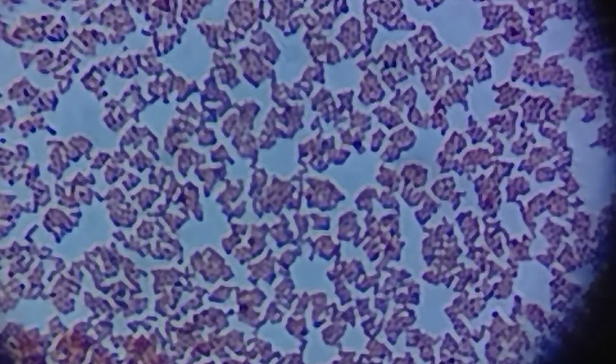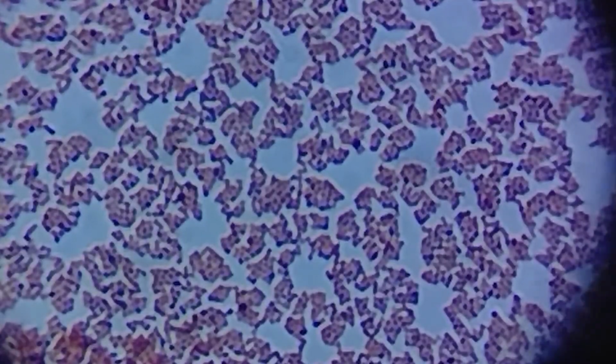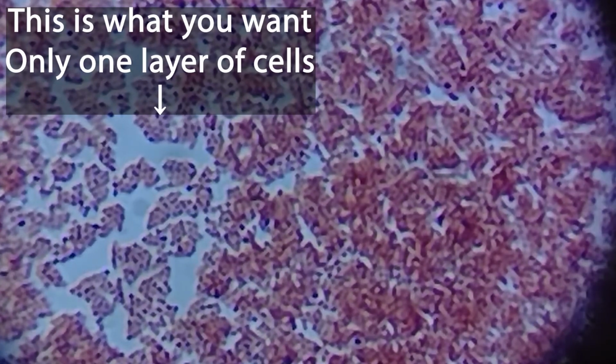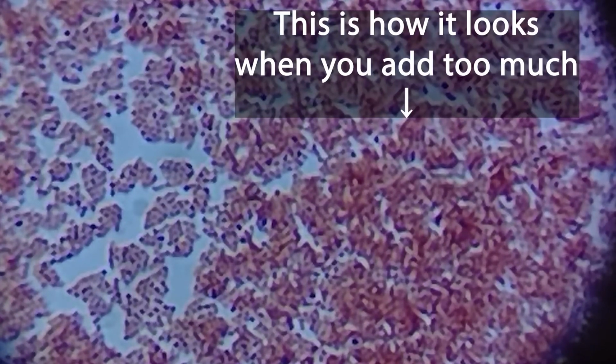And now we'll look at the Staph epidermidis under 100x. All right, so this is the Staph epidermidis under 100x oil microscope lens. And I think it's, yeah, that's about as focused as I can get it. Yeah, the part over to the left, you can make out the shape and arrangement of the bacteria a lot better.